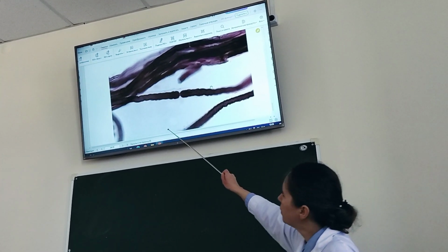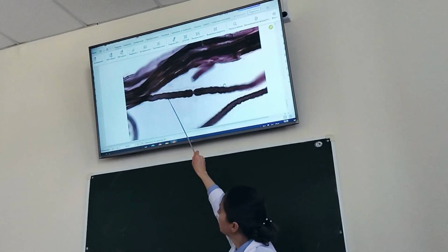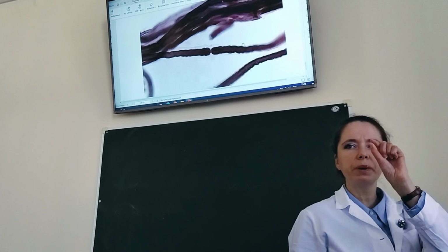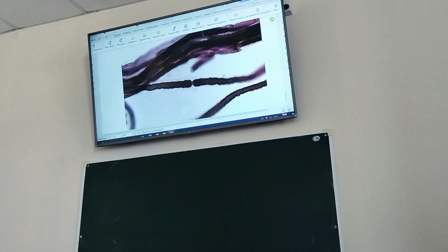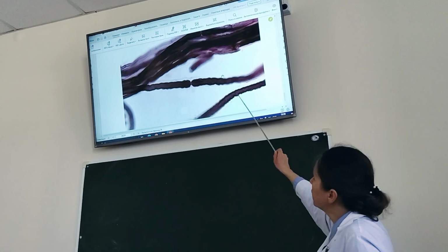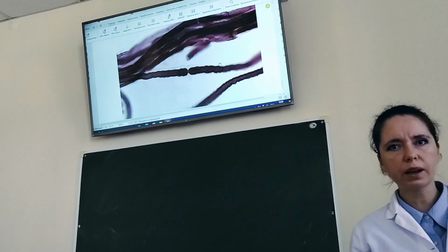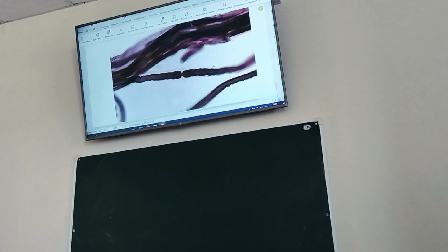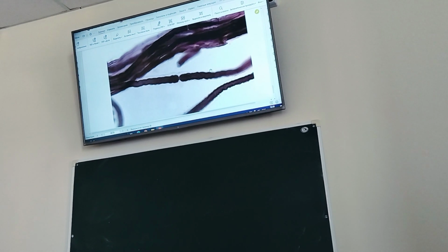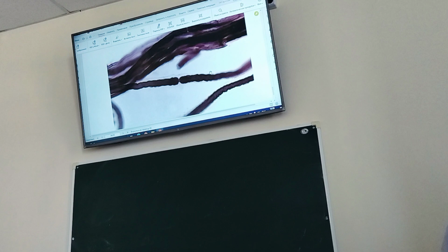Sometimes I can find myelin clefts. Yes, Schmidt-Lantermann clefts, small spaces inside the myelin layer. Inside, there is the axial cylinder, the axoplasm or axon cylinder, but it remains invisible, unstained in osmium. This is quite enough for the explanation.